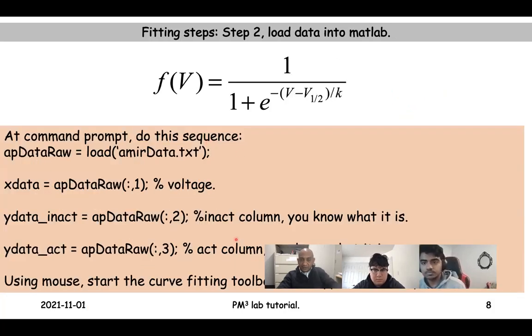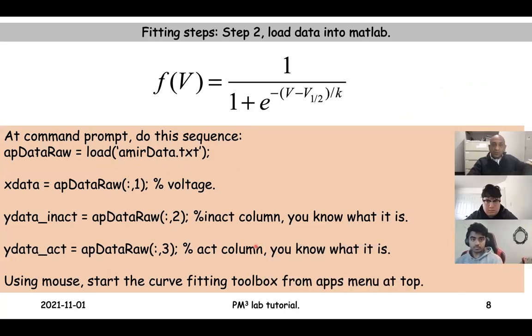In step number 2, and this is something that we will do momentarily after I finish running through the slides, you are essentially looking to load your data into MATLAB, not into the curve fitting toolbox, but simply into MATLAB.